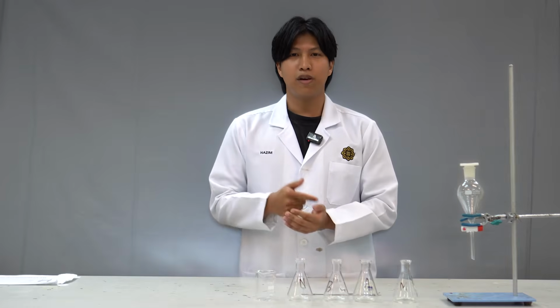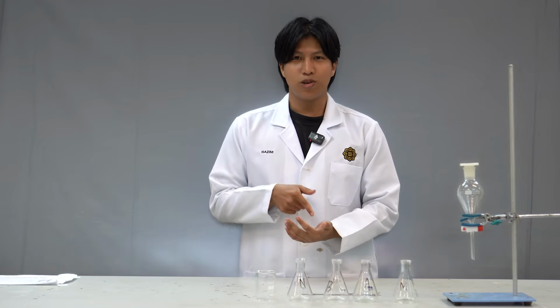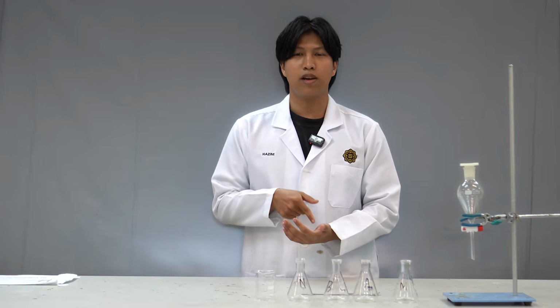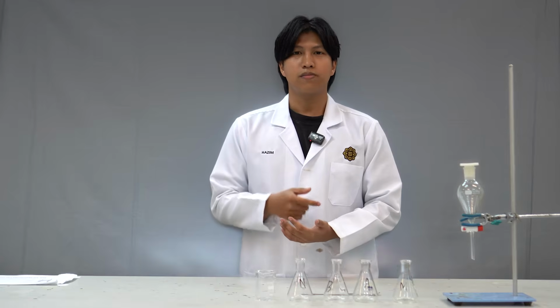The immiscible solvent we will use in this experiment is dichloromethane, which is DCM. DCM is a non-polar organic solvent that is immiscible with water, and it also efficiently dissolves and separates all the organic compound from an aqueous solution.